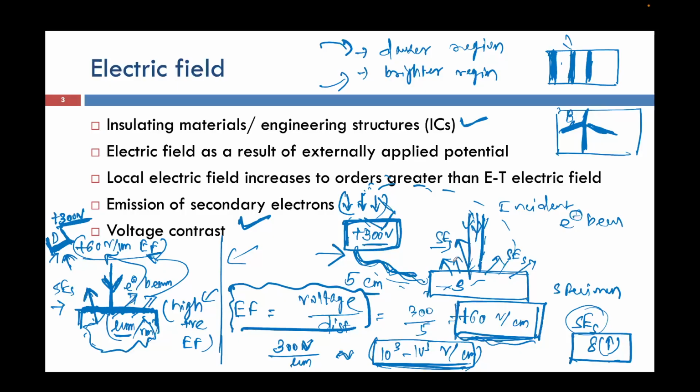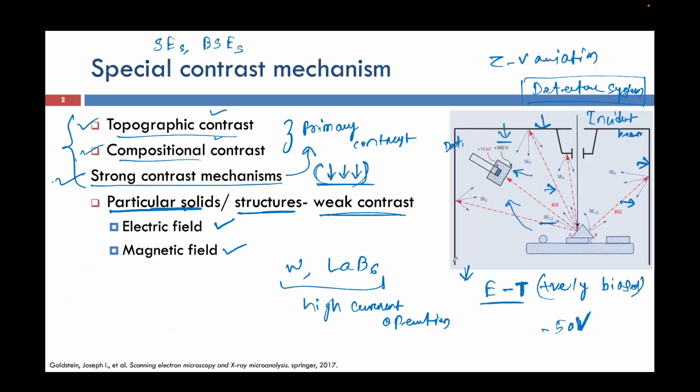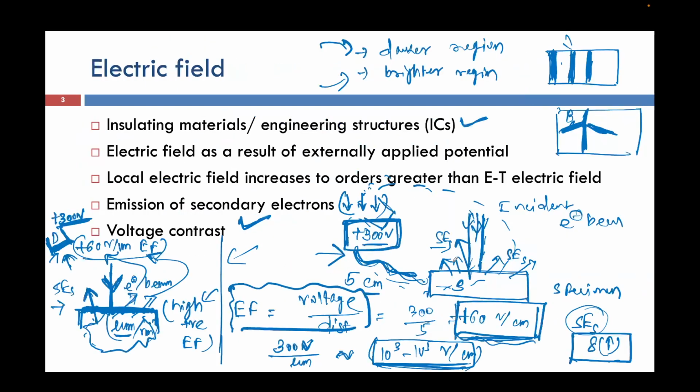And so the normal detector mechanism, whichever I showed here, is the general mechanism. Considering this factor, this electric field mechanism, we can see this contrast mechanism considering that we are calculating the electric field from a very, very small region.